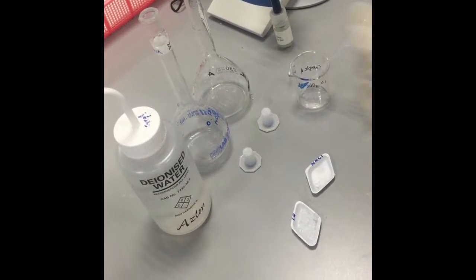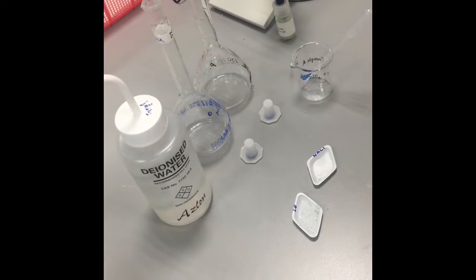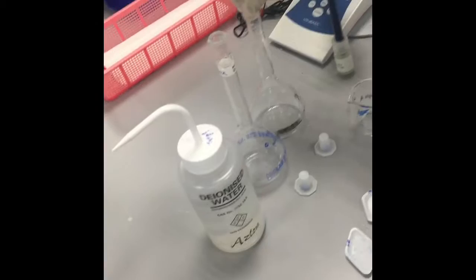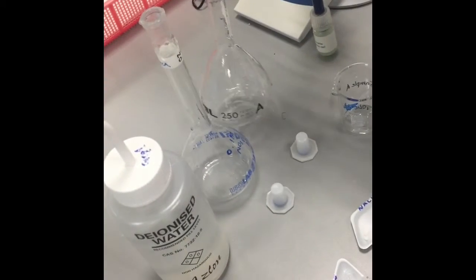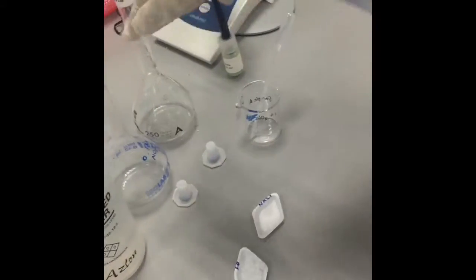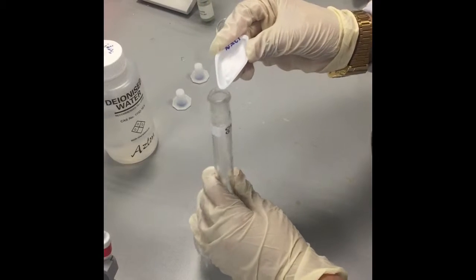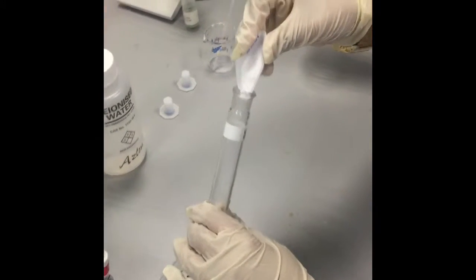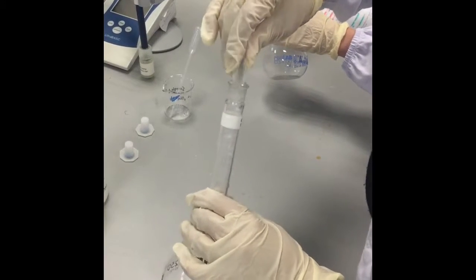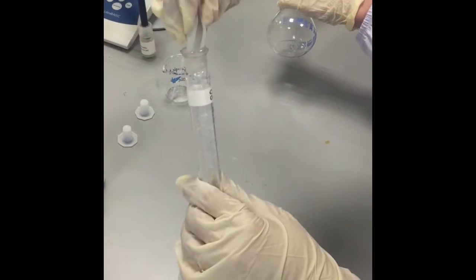In assignment 1 also, after measuring calcium nitrate and sodium chloride, what you need next is deionized water, 2 volumetric flasks which are 250 ml each, a pipette, a beaker, as well as 2 caps for the volumetric flask. Firstly, add all the solutes into the volumetric flask carefully. Ensure that everything is inserted into the volumetric flask.